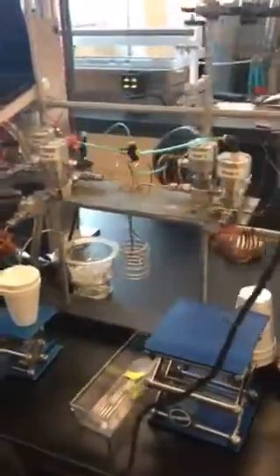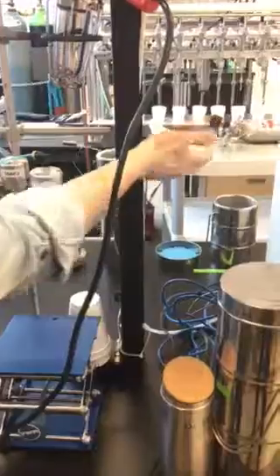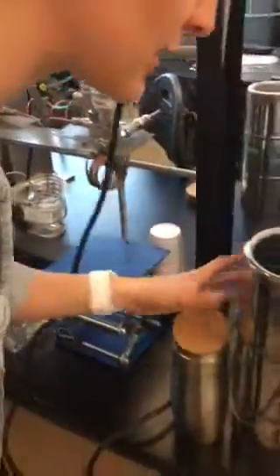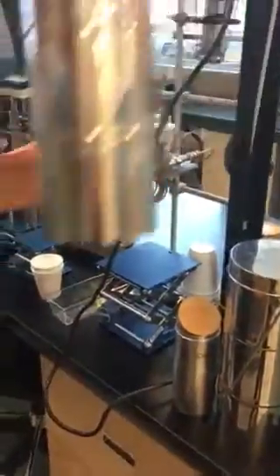But basically what happens is the clean CO2 comes through here, and then using liquid nitrogen, we should use some liquid nitrogen. Do we have any available? Alright.